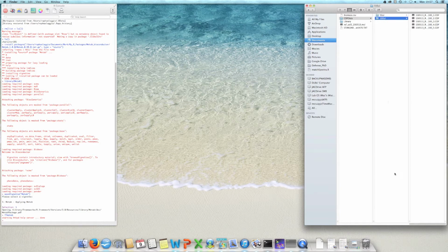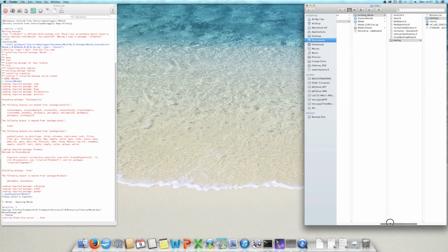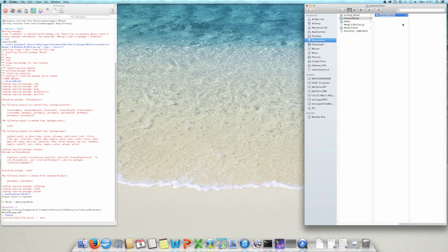So let's now build the structure required by Metab. So that's the folder that I prepared for us, just to show how it works. Example Metab. So I organize the files here in the way we need to run Metab. What I need to do is to create one folder for each experimental condition, the same way we had before. So one experimental condition is called 50 microliters, could be any name. And the other experimental condition is called 100 microliters.